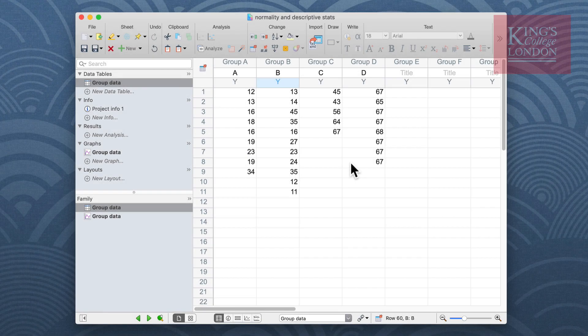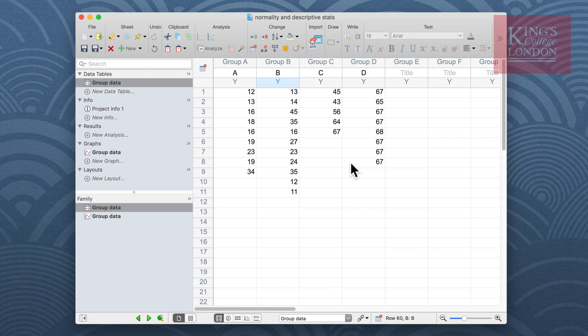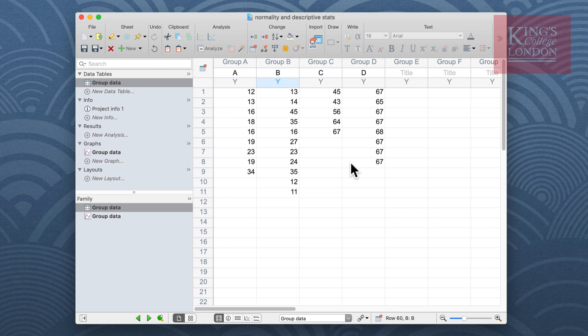Hello, my name is James Clark from King's College London. In this brief walkthrough I'm going to look at ways of describing your data sets and also how to test for normality within your experimental data using GraphPad Prism.